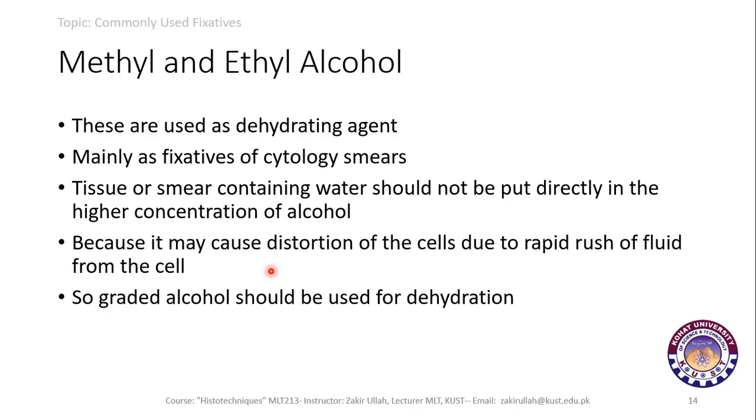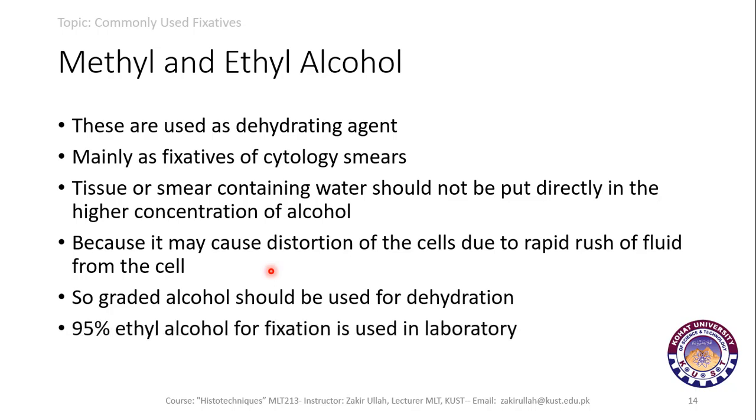So, for processing the tissue in alcohol, graded alcohol should be used for the dehydration purpose. 95% ethyl alcohol is used for fixation in the routine laboratory.